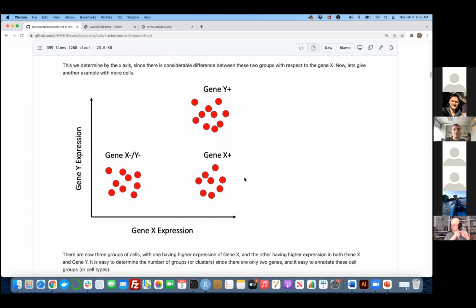But most people want to do this process manually because it's not like some particular gene will always indicate that subpopulation in every kind of biological sample. So again, it's biology, it's chaotic. So you have to go with your discovery instead of the basic knowledge. But you can find other methods out there where you can automatically annotate.